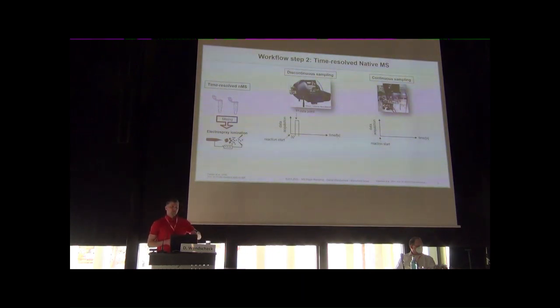So you have a 96 well plate, and in this you start the reaction of mixing, and then the robot picks the sample and transfers it directly to the ESI. By this, the robot has a delay time of 32 seconds, and for each data point, it starts the process again and again. So the reaction takes place in the plate where you have good thermal control, and then it always needs 32 seconds to use a new needle and start an acquisition.